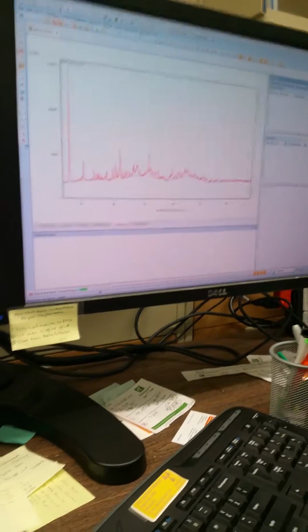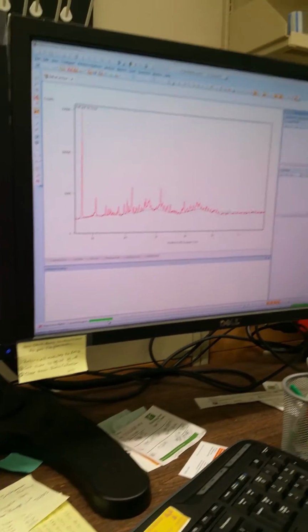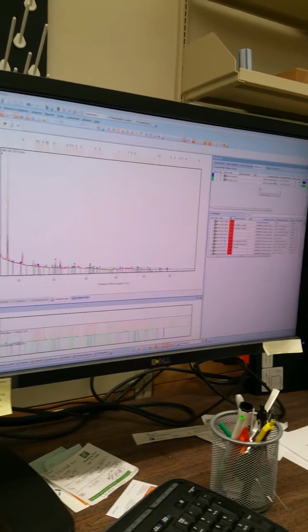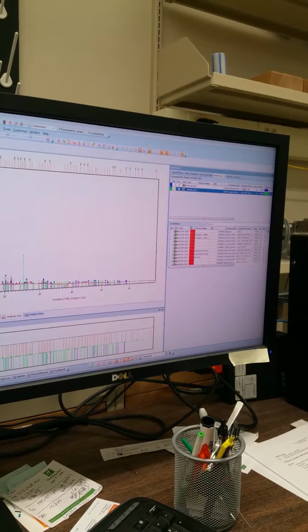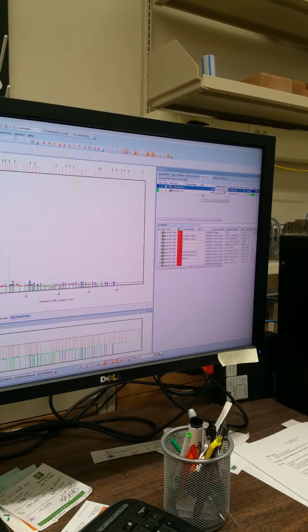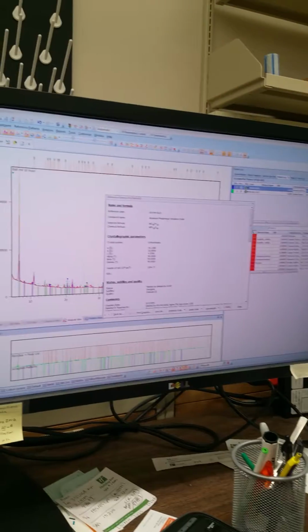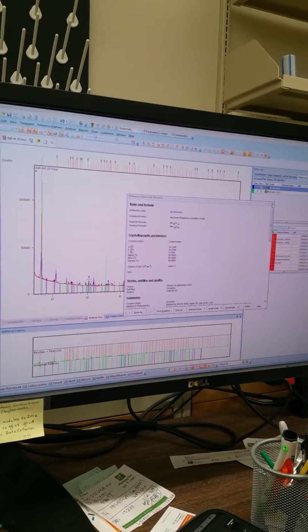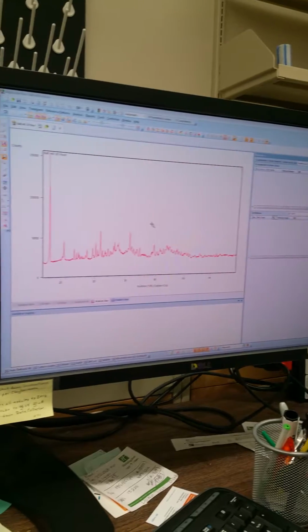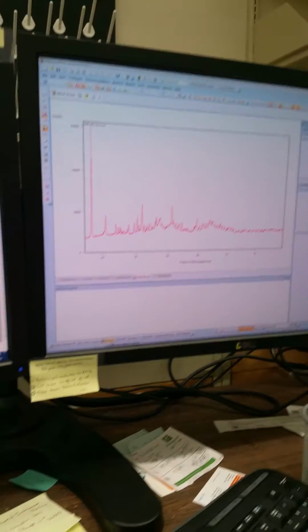So if you click on identify all, it's going to try to find them and automatically picks up the ones that it thinks are the good ones. But actually you can see what it shows here. For example, this one is aluminum, phosphorus, vanadium oxide. This is not what you have, right? So what you need to do is the default.